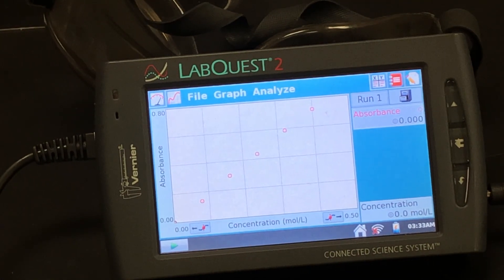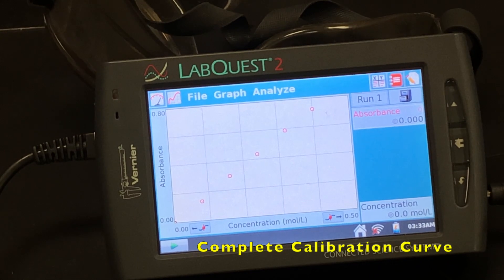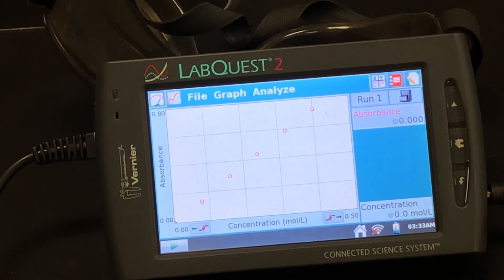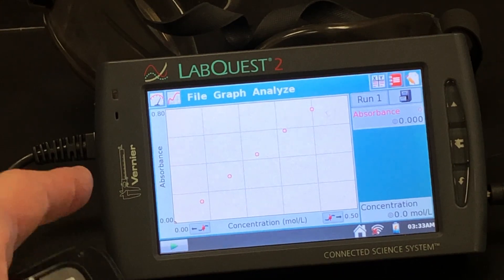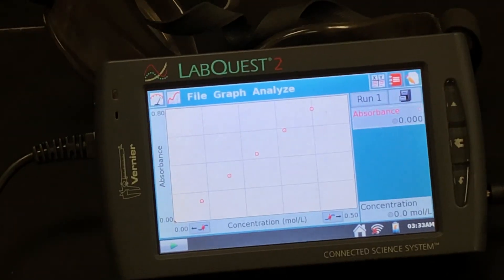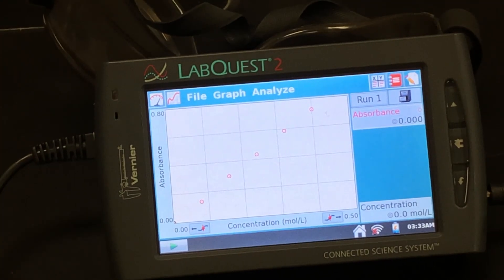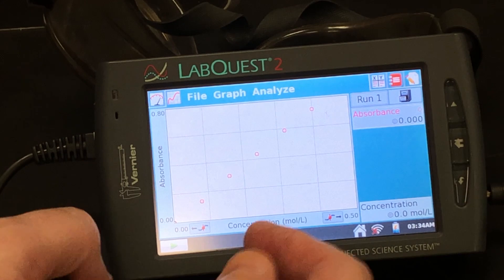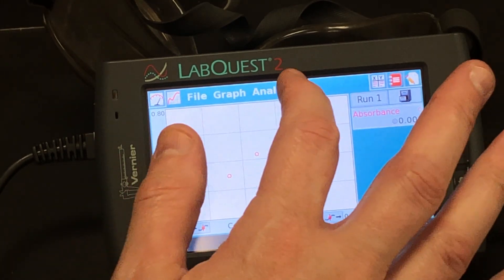We've taken all our measurements, and you can see there are 1, 2, 3, 4, 5 data points that you can see, plus an extra one for 0, which is pure water. And as you can see, there is a definite relationship or trend between concentration here and the absorbance. You'll see that as the concentration increases, the absorbance also increases. It also looks like that if you connected the dots or treated it with a statistical analysis, you'll see that this looks pretty linear. So let's do that right now.